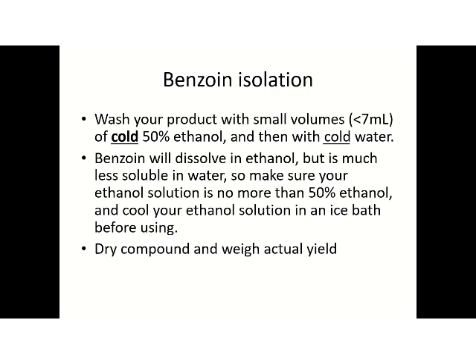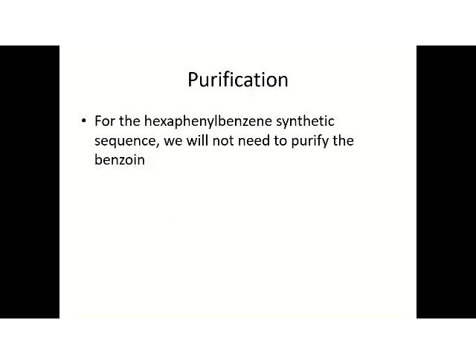Again, wash the product with a small volume of cold 50% ethanol, and then with cold water. First with cold ethanol to filter the product, and then the water to remove the impurities that can be salts, can be the starting material in excess. Remember, it was a salt, it will go with water, right, and other impurities that we are going to have.